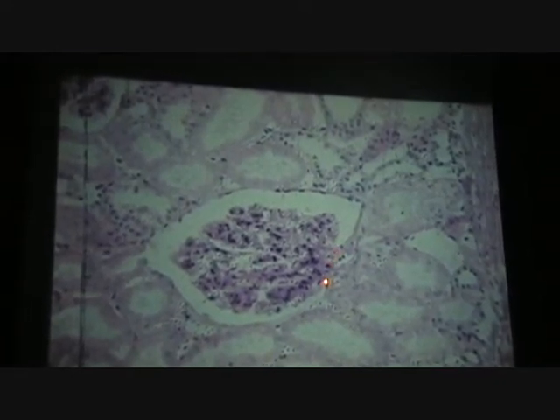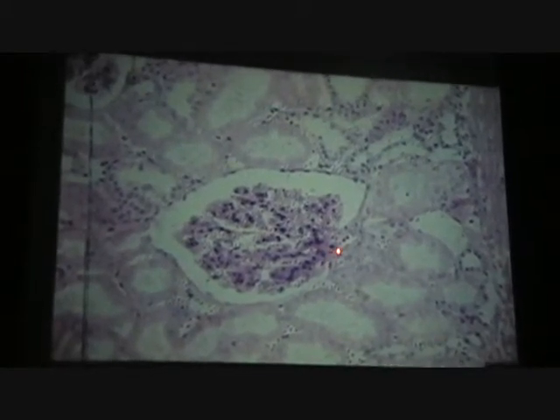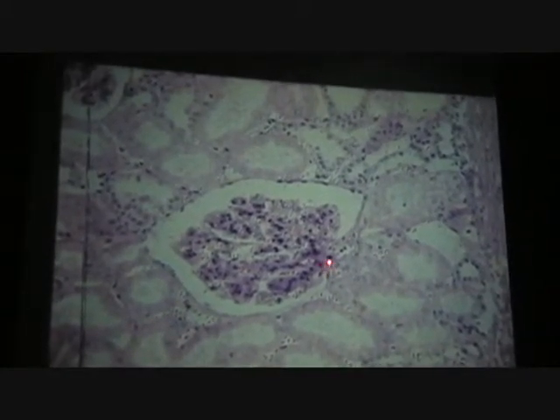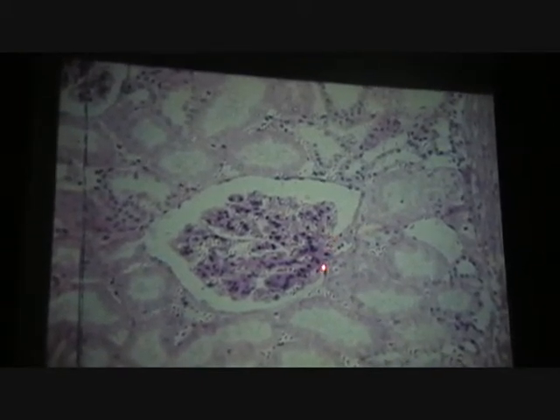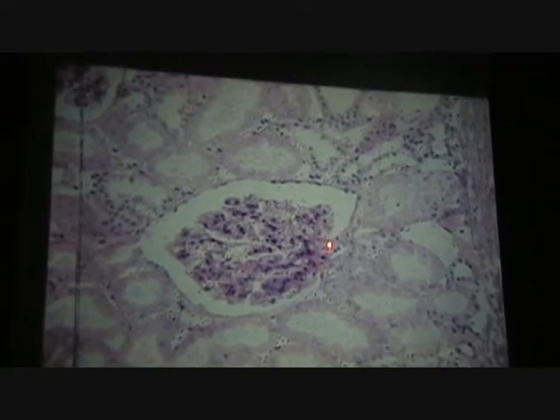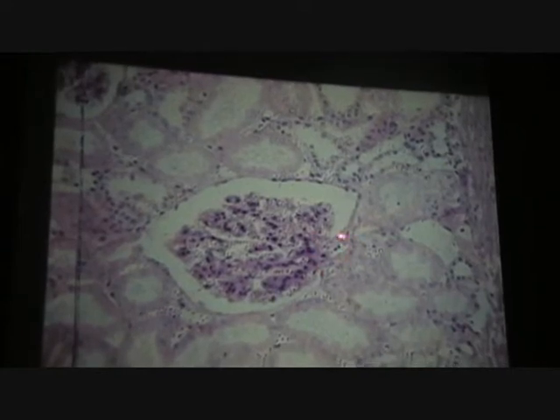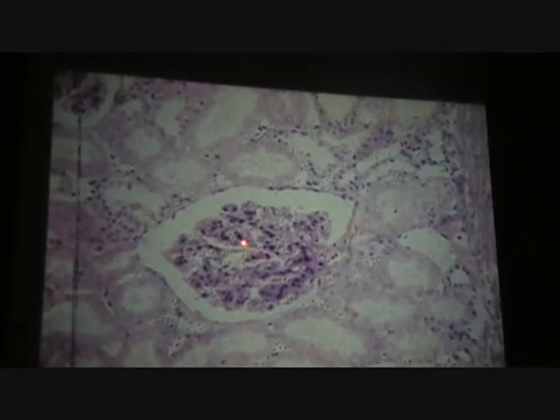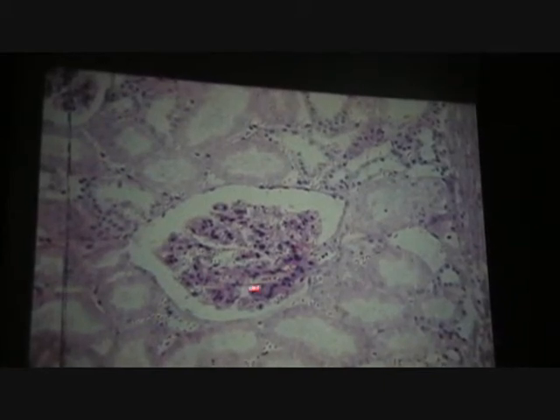discontinuous from here to here. The blade caught it just right. So it caught the air hole through the beach ball. So you can abbreviate this structure. And that's the VP, vascular pole or pore. And that allows the blood vessels to get in and out, which are making this clump.